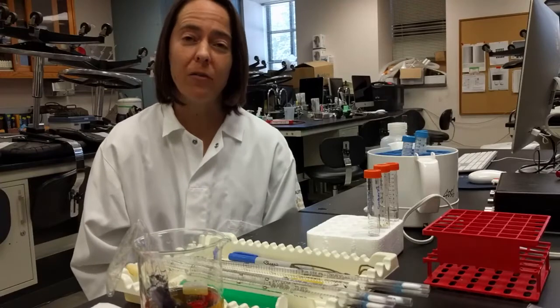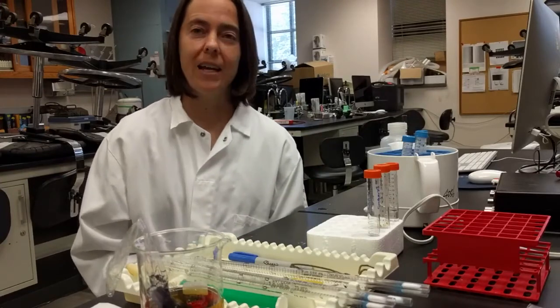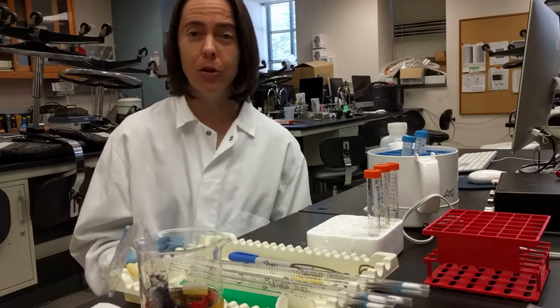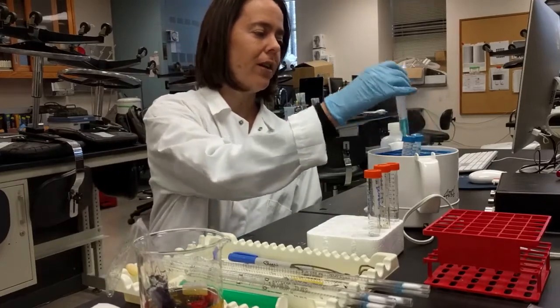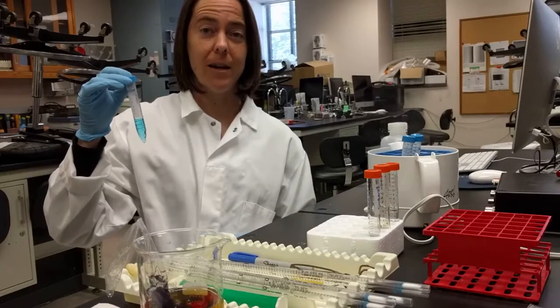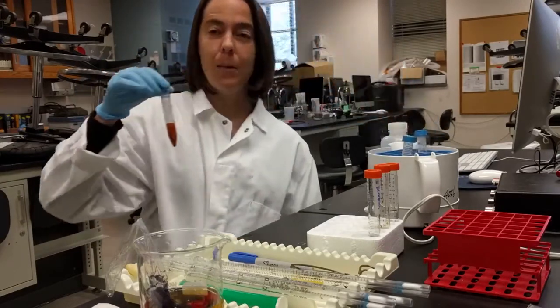All right, so it's been about 5 minutes, and these tubes have been sitting in boiling water. So that gives the Benedict's reagent enough time to react with glucose if it's present. So let's take a look at the colors. So this is our control tube. Okay, so make note of that color after 5 minutes. Okay. This is the bag.